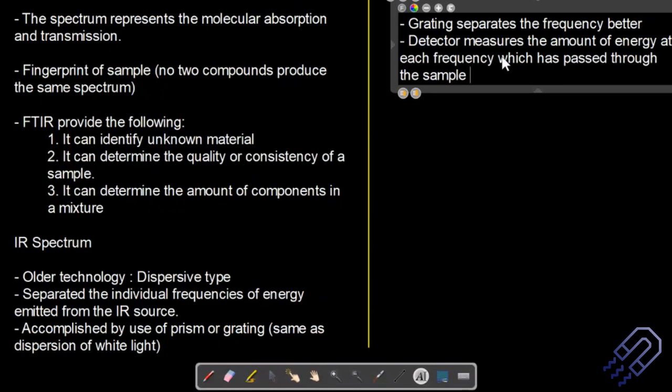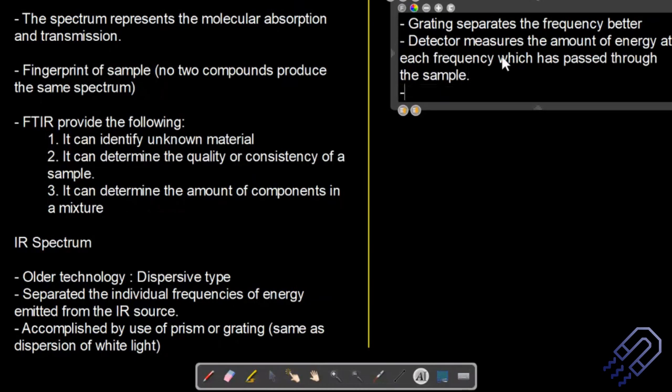So this is important again. And then after we have this information, what we do is we usually plot. And what do we plot? We plot the intensity versus frequency. So we plot a graph of intensity versus frequency, and that's very important. Once we plot the graph of intensity versus frequency, we can get the information, and that is exactly what is getting plotted here.